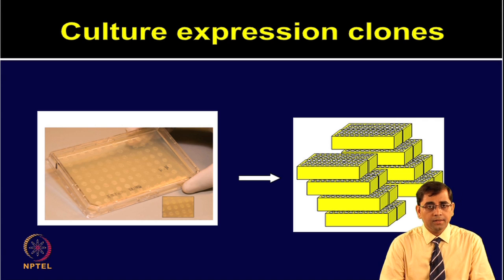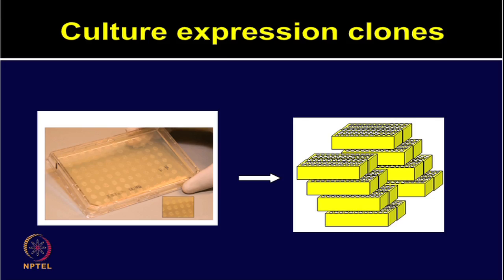The only difference here is that things have to be much more automated, and the steps have to be much faster and in a high throughput manner. If you are performing these plasmid preps in tubes, then you have to do it many times, which will increase the irreproducibility and manual artifacts. So, all these steps are preferably performed using an automated liquid handling system. It is difficult to achieve high density, so all these steps need to be automated.